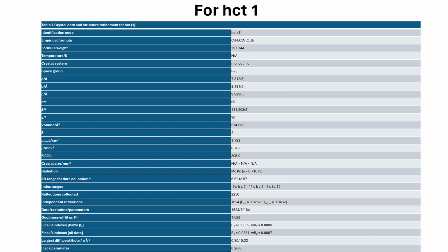This is due to the fact that we have considered the model as a fully spherical electron density model. We have not considered the bonding part as well, right? We can also call it the difference in the electron density after having all the refinement, after having all the proposals of the model.